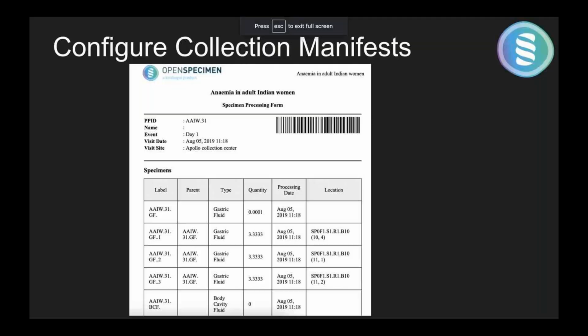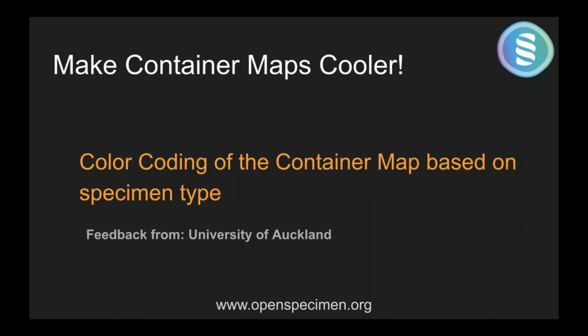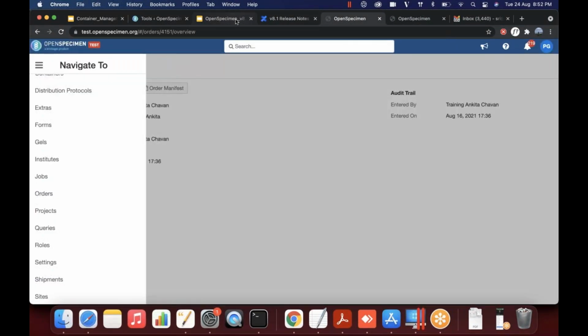Just these screenshots of the same things. Some of the administrative features. Let's see, the container map looks cooler now. Let me see. Actually, this is a screenshot.